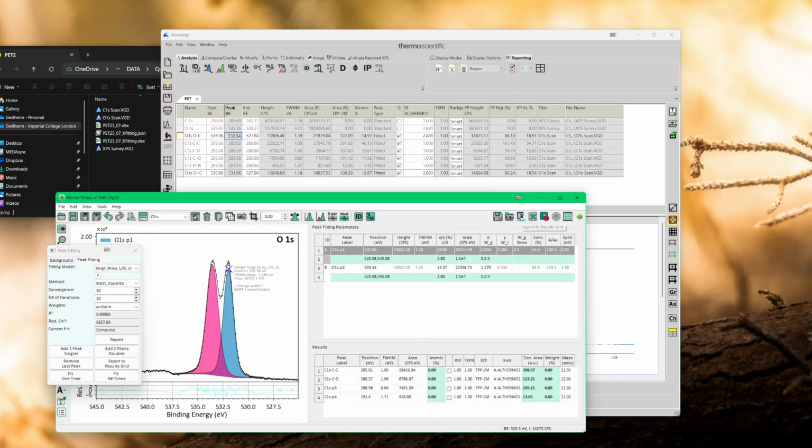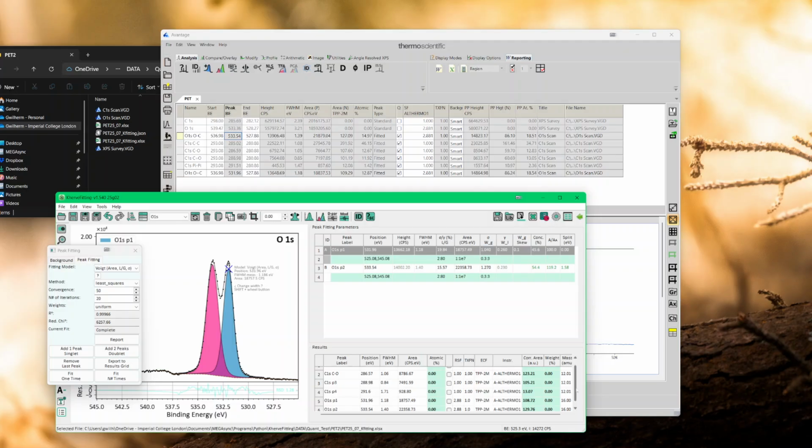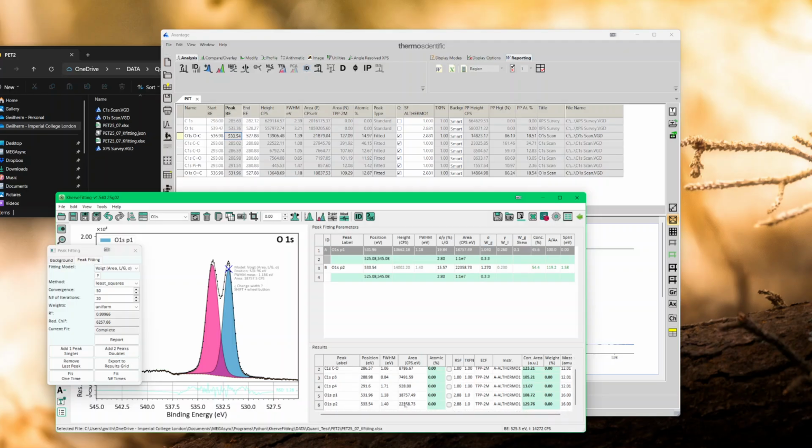It gives 109 as a corrected area. And if I pass that, export that into the results grid, we may find, so this was peak 2, and peak 2 was this one, and we found 108, and he found 109, and it shows that it's exactly the same.